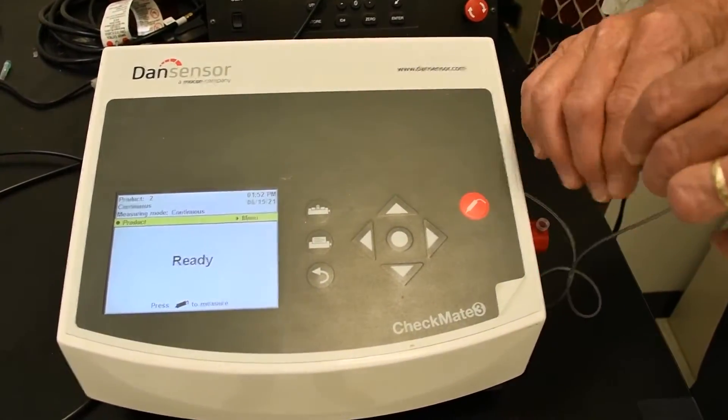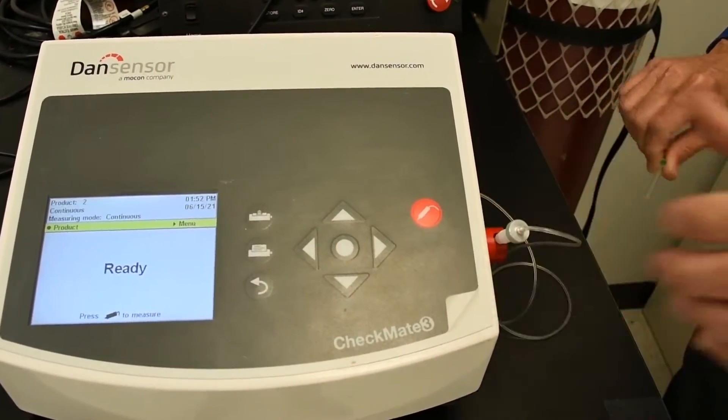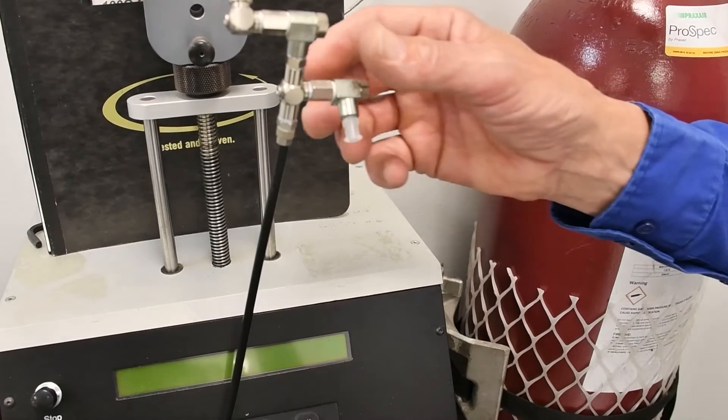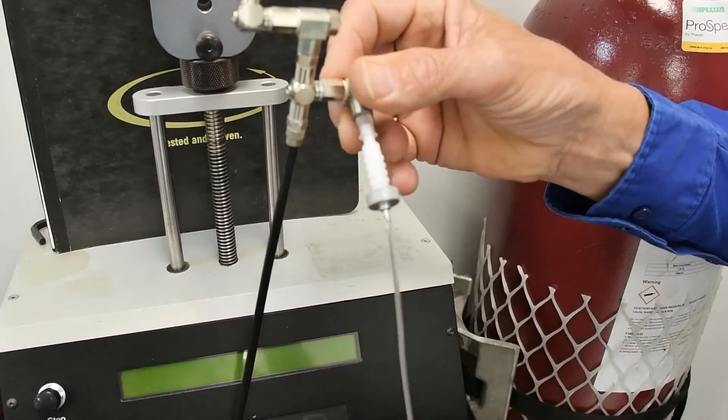Remove the needle from the pen of the sampling kit on the Checkmate 3. Now I'll demonstrate the verification process for the Checkmate 3. Connect the measurement hose from the instrument to the pressure relief kit.